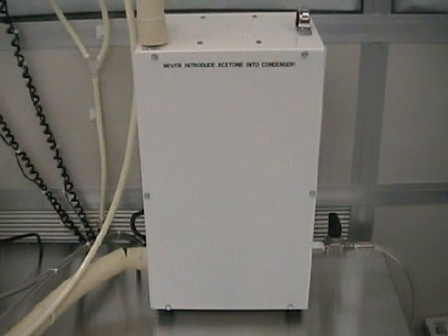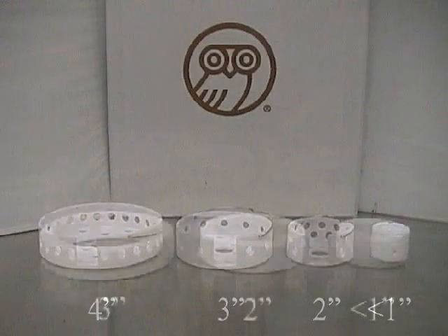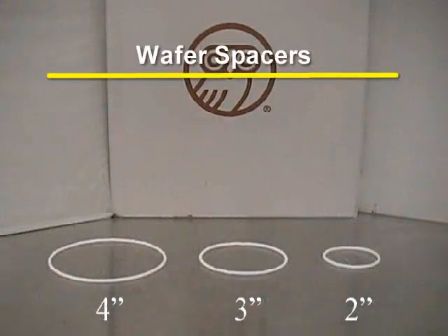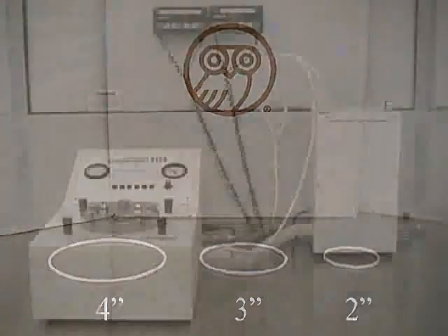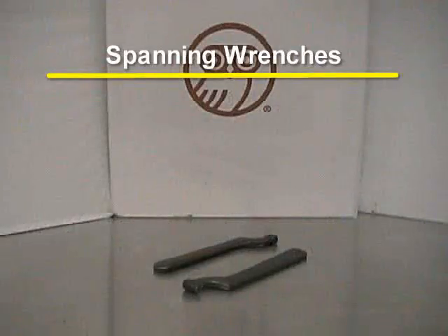The unit also comes with several different sizes of wafer holders, chamber inserts, and wafer spacers. The supercritical dryer can process wafers ranging in size from less than an inch up to 4 inches in diameter. We should also find spanning wrenches located by the unit, which are used for tightening the chamber lid.